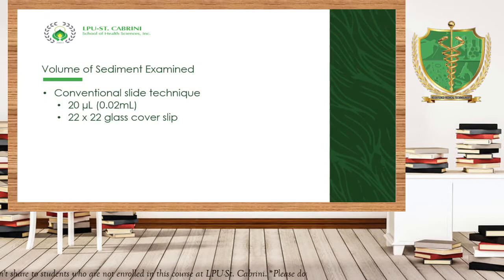Okay? So for the sediment examination, it is recommended to have a microscope. Well, of course, what the jokes are. Definitely, how are you going to do a microscopic examination without a microscope? Well, possible if you have the machine.